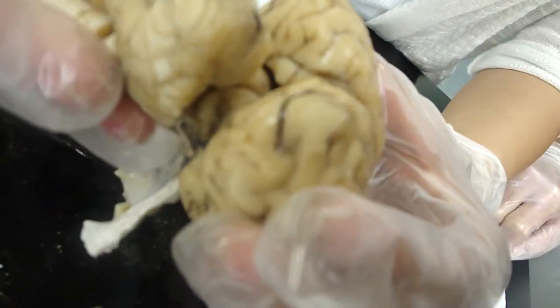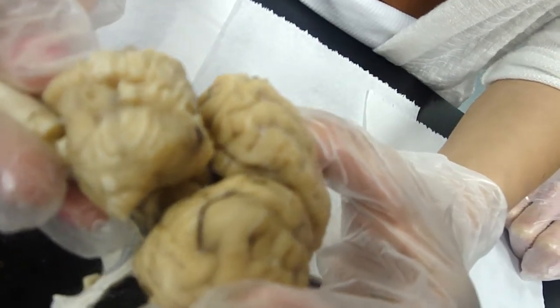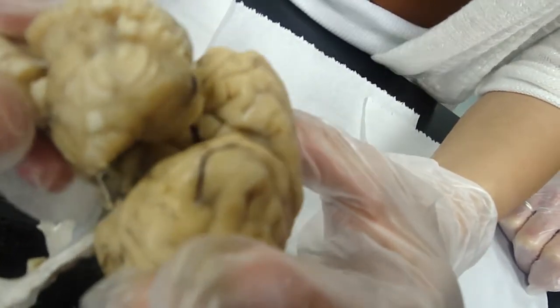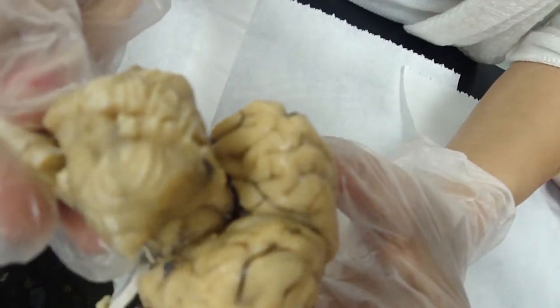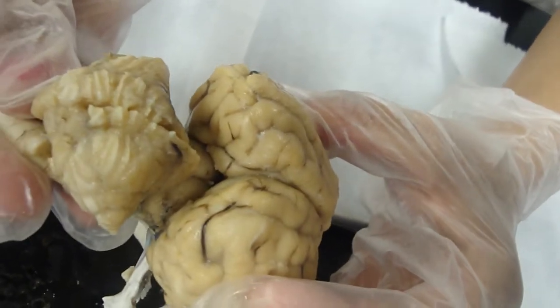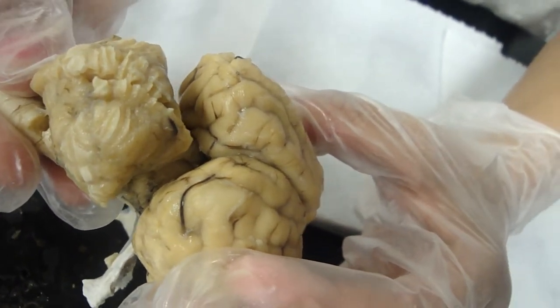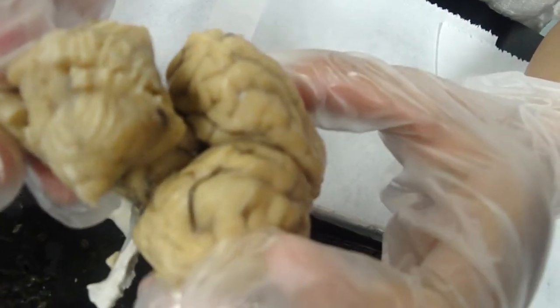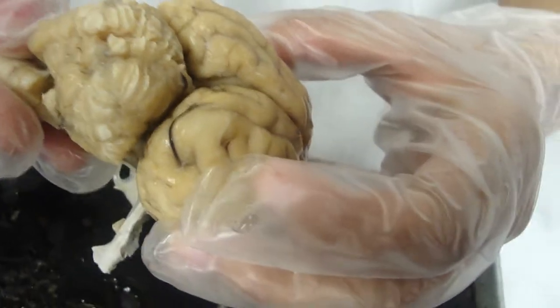Looks like a butt. I'm going to turn the brain back around so that we're looking at it as we were in the sagittal section. You can see where those four things are. That's called the corpora quadrigemina. This would be the superior colliculus up here, and the inferior colliculus down there. What is that? That is one half of the corpora quadrigemina. The total corpora quadrigemina requires two superior colliculi, one from each side, so we need the whole brain together.